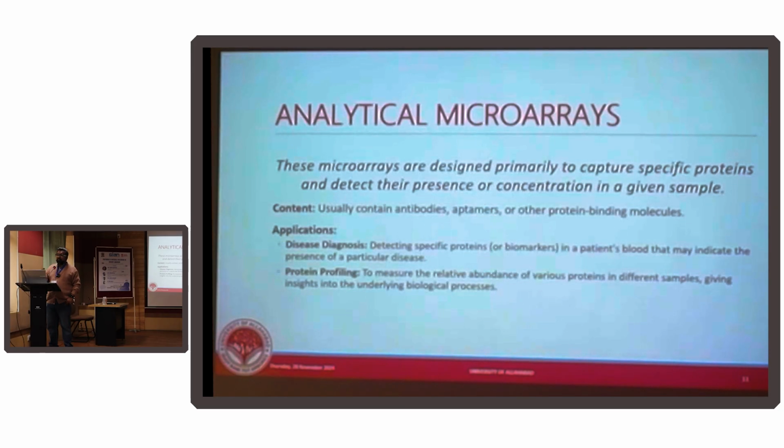So even if you have to take blood, you don't need to draw 5 ml or 10 ml. Even a 1 ml draw would be sufficient for maybe 200 microarray experiments. So that way your procedure, or your test, is cheap, non-invasive or minimally invasive, as well as translatable at a very low cost.